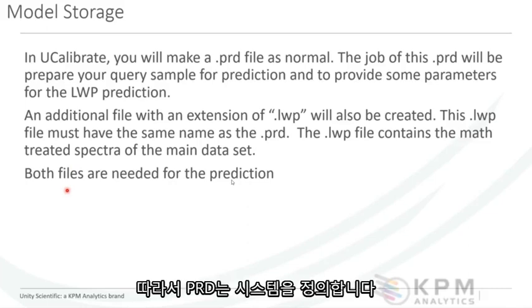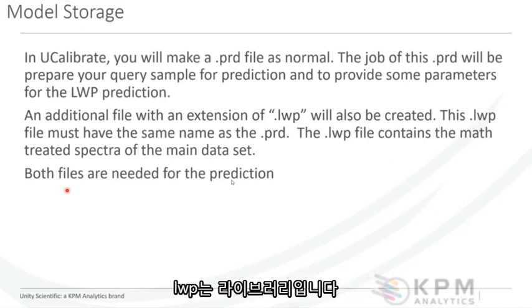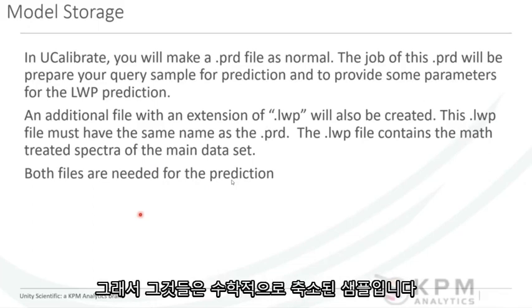So the PRD is defining the system. The LWP is the library. It's the larger calibration library that contains reduced samples that will be used for the calibration. So they're mathematically reduced samples.